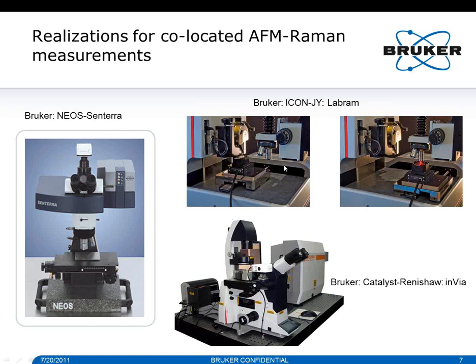And what you see on these two images is on the left side the sample in the AFM analyzing position, and then we can move the sample over, and you see the red Raman beam here on for educational purposes. That will be the position to do a Raman measurement. So again, a nice combination, combining a top-of-the-line AFM with Raman spectroscopy.